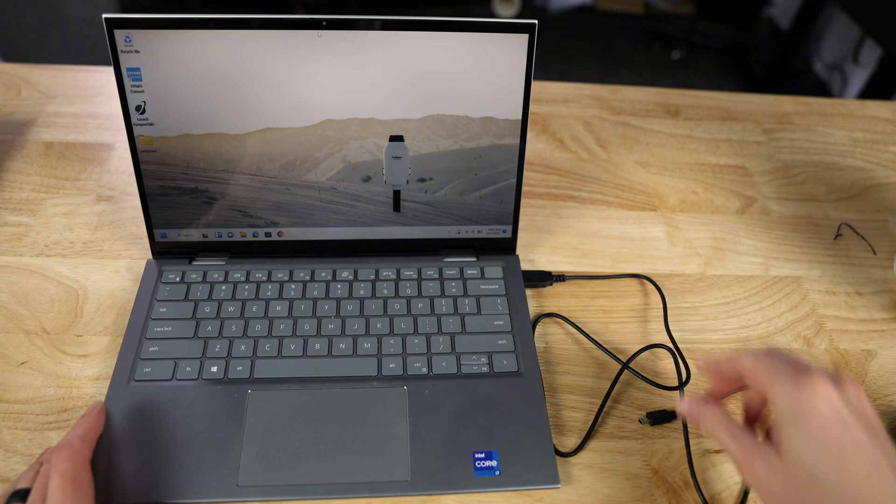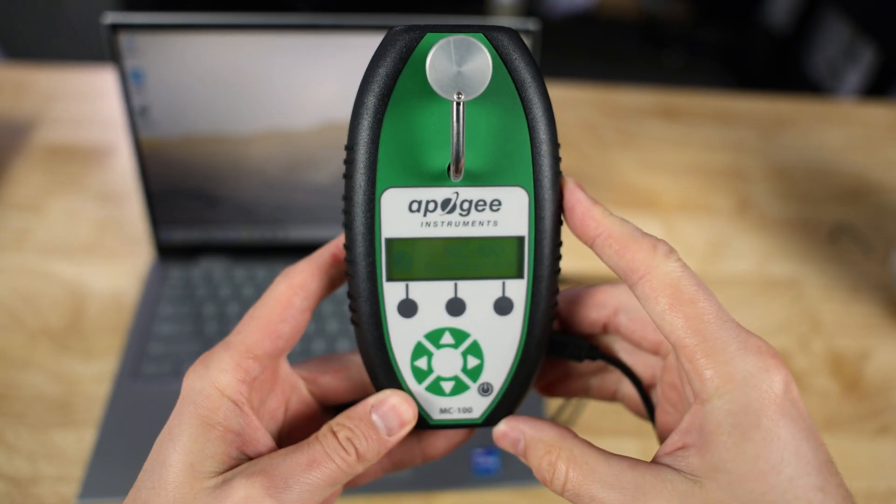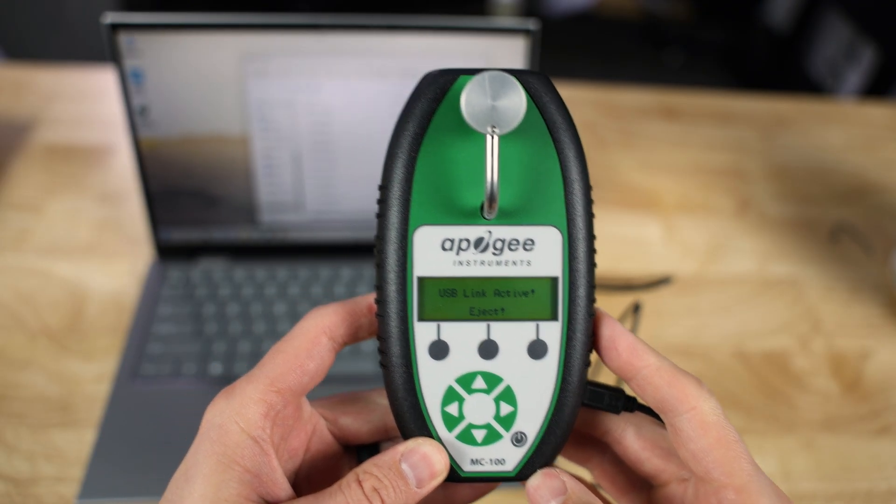After you're done taking measurements, it's time to transfer the data to your computer — this works exactly like a USB thumb drive. Grab the USB cable, plug it into the computer, then plug it into the meter. With it plugged in, turn on the meter by pressing the power button in the bottom right corner. It'll take a second to load; once done, press the Data button — the one in the middle — and it should pop up on your computer just like a flash drive.